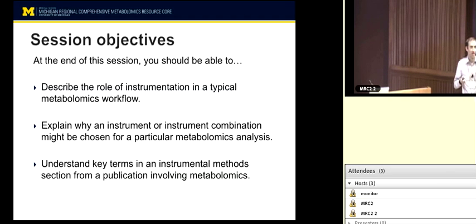The real thing to think about here is what you're going to try to get out of this. Most of you are probably going to be using the core lab to run your samples for you. So you may not need to know exactly how to run a mass spectrometer, and we're not going to teach you how to run one here. You might not even need to know exactly how a mass spectrometer works, as long as the data that it produces is useful.